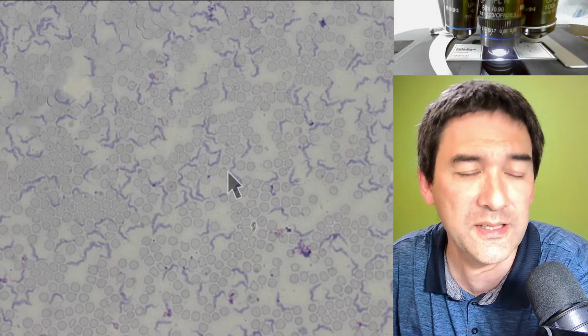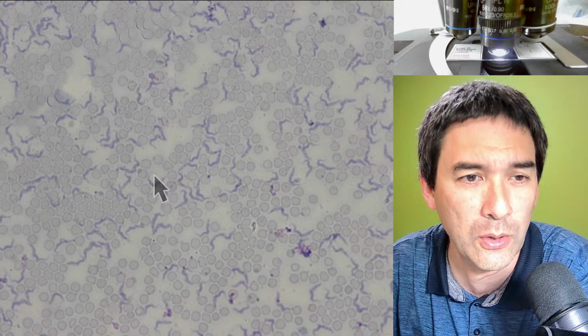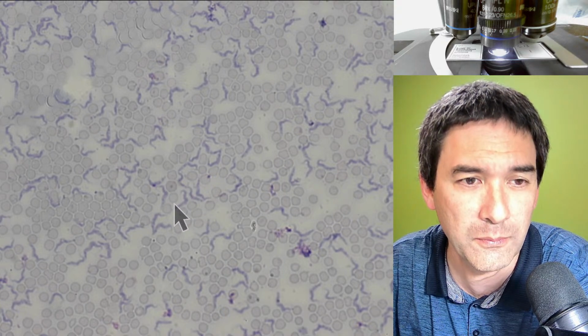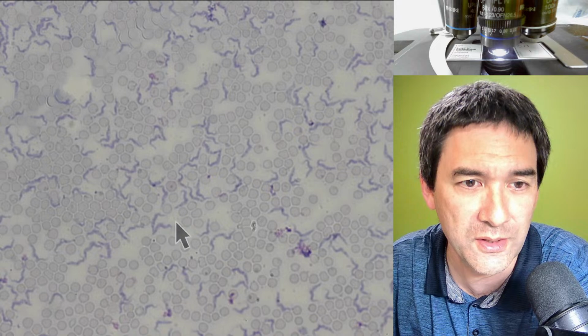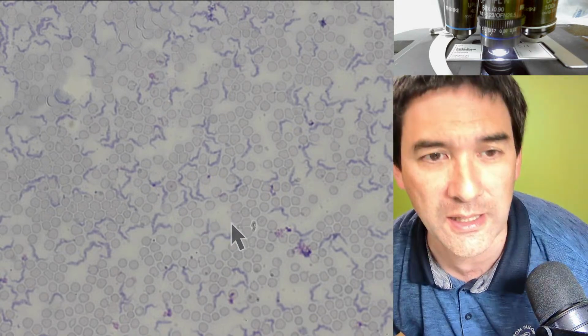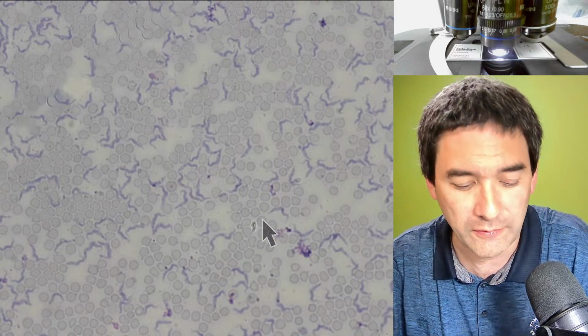By the way, if you're interested in this, you've got to check this YouTube channel. I did actually make a separate video about those, some months ago, last year, I don't know. These are single-celled organisms, those trypanosomas. I actually showed you exactly the same slide there, but simply to show you a little bit on what level we are here.